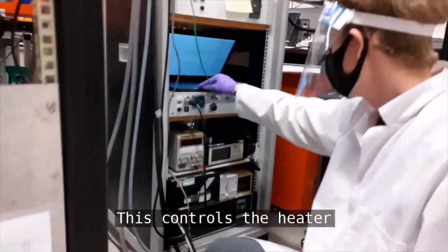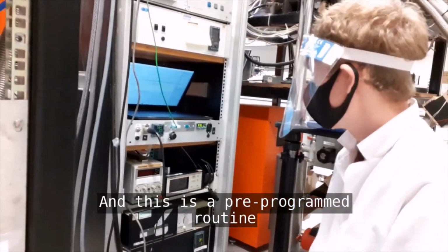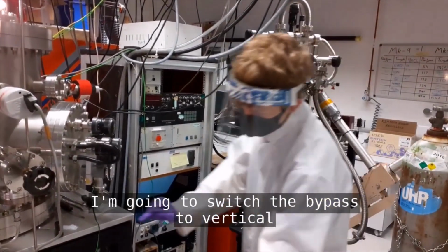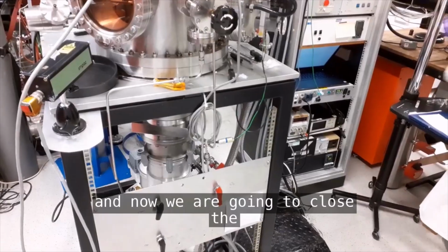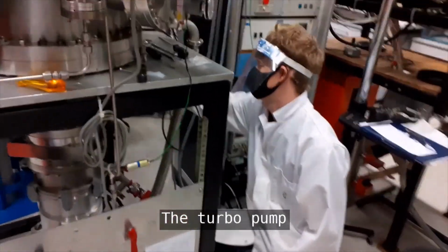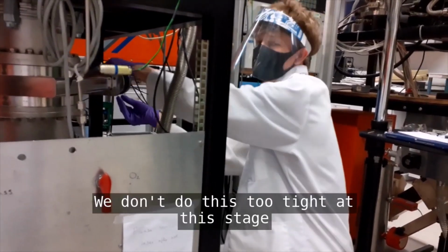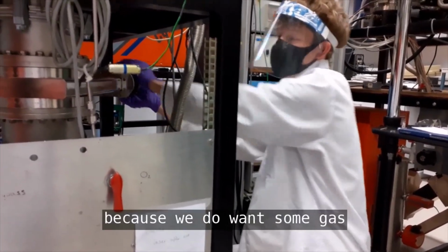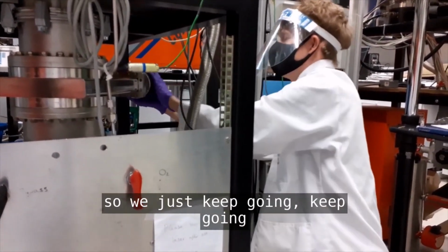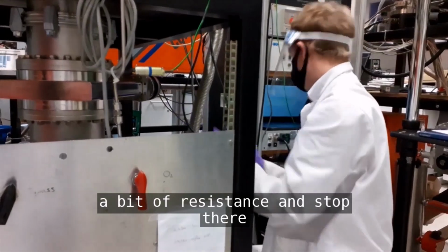This controls the heater, and I just hit start. This is a pre-programmed routine, and it's going to take us up to 750 degrees C. So next step then, I'm going to switch the bypass to vertical, and now we're going to close the gate valve to stop too much going through the filter. We don't do this too tight at this stage, because we do want some gas to flow through, just not too much. So we just keep going until we meet a bit of resistance, and we'll stop there.